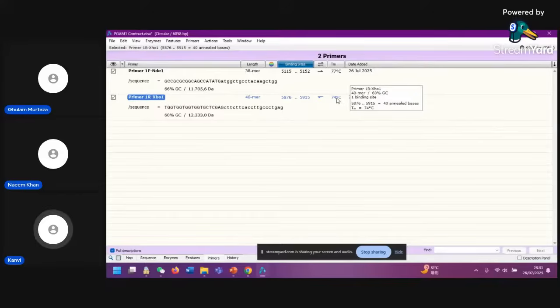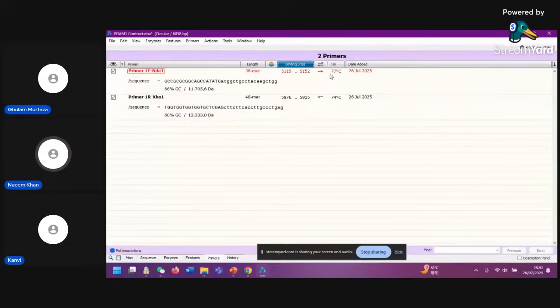Sir, I guess you were not audible in between. Can you please once repeat? So I said Snapgene will tell you about the relevant temperature. So it's telling you 77 and 74. According to my experiments, I was dividing both.